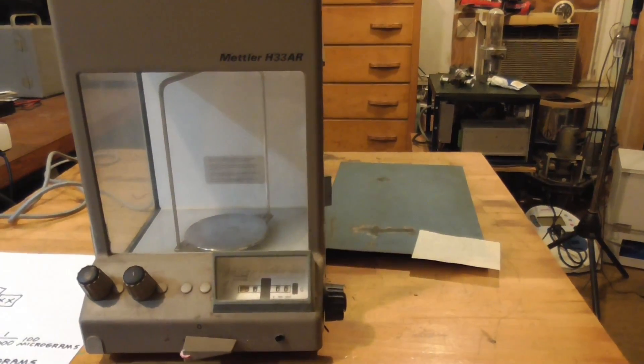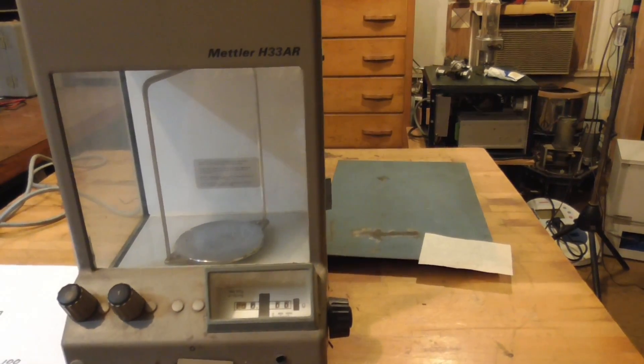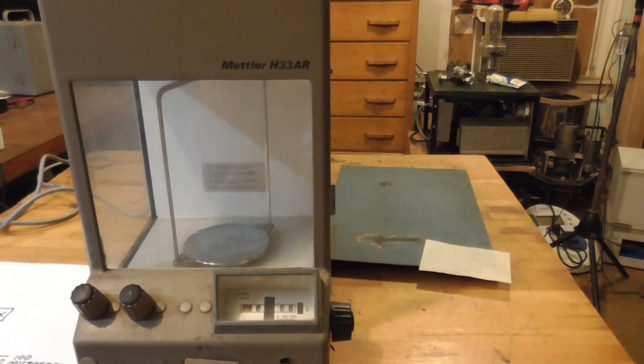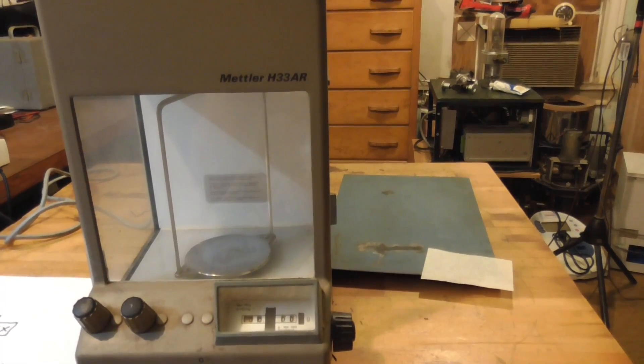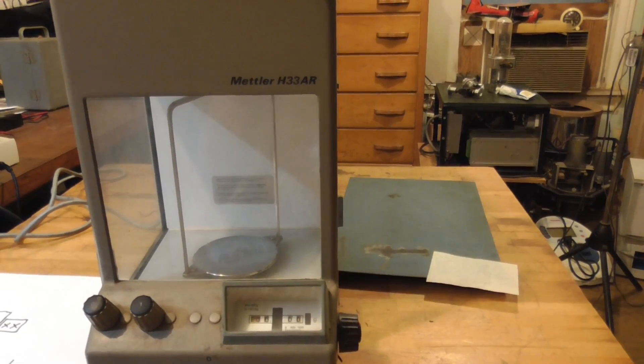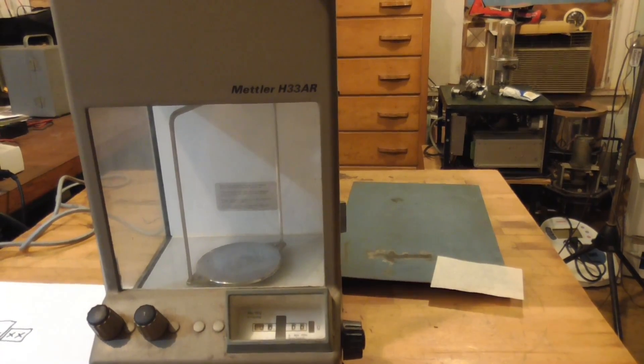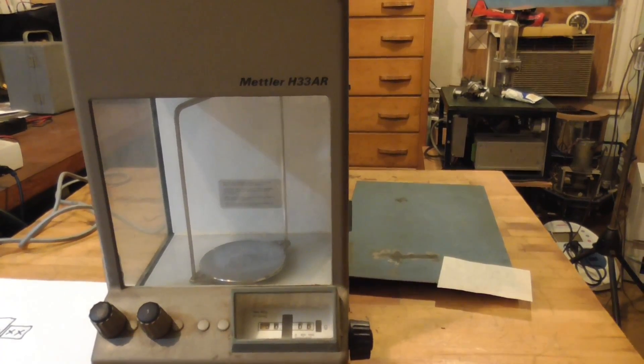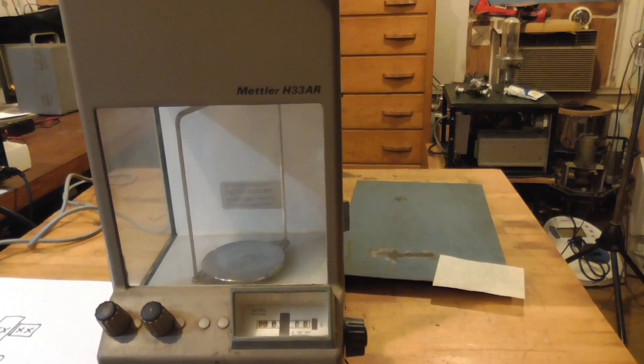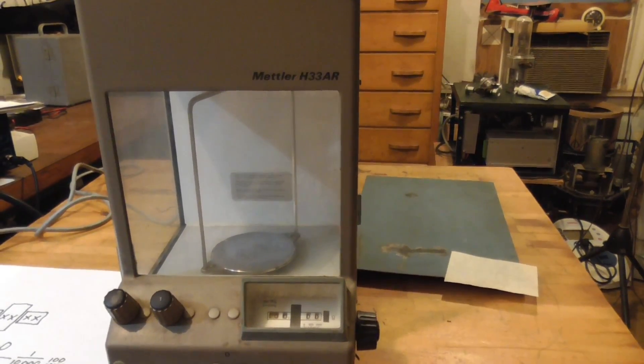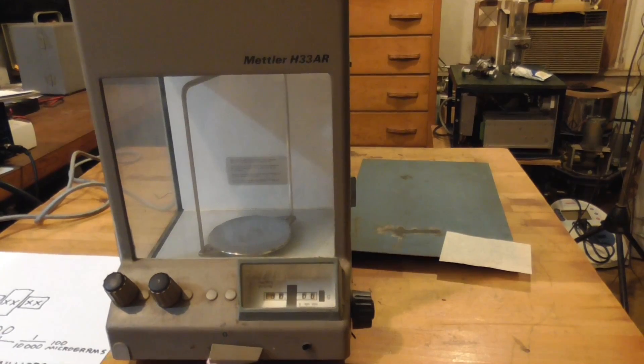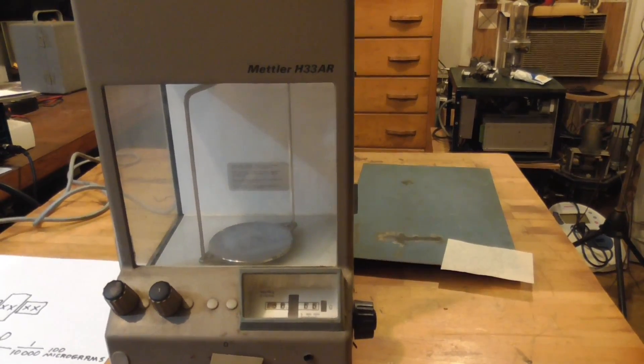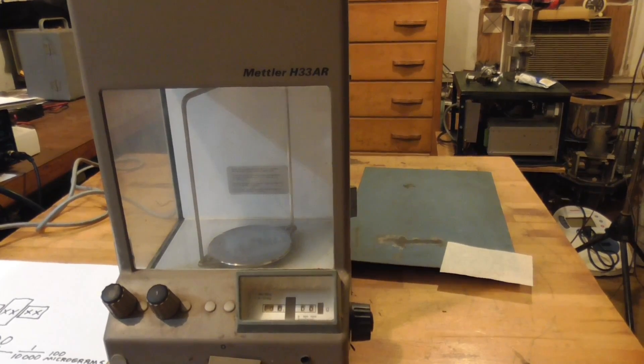This particular model will measure from 160 grams, which is about maybe close to a third of a pound I guess, and go down to measure a hundred micrograms - a hundred millionths of a gram. A gram is a very small amount, and to measure a hundred millionths of that gram? Wow. Let's look at the inside of this thing.